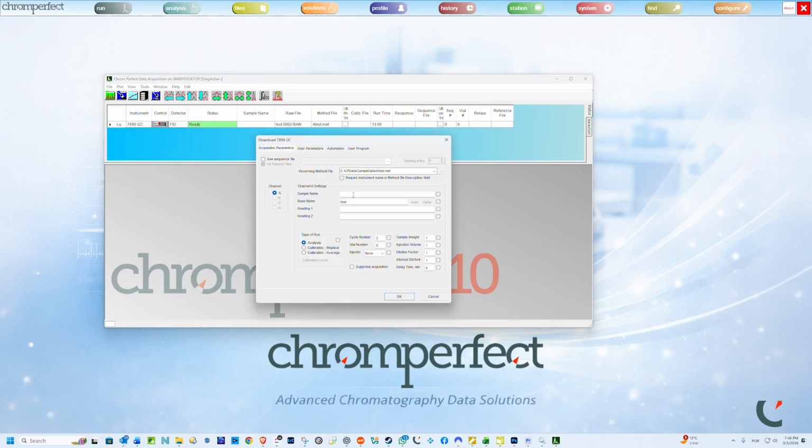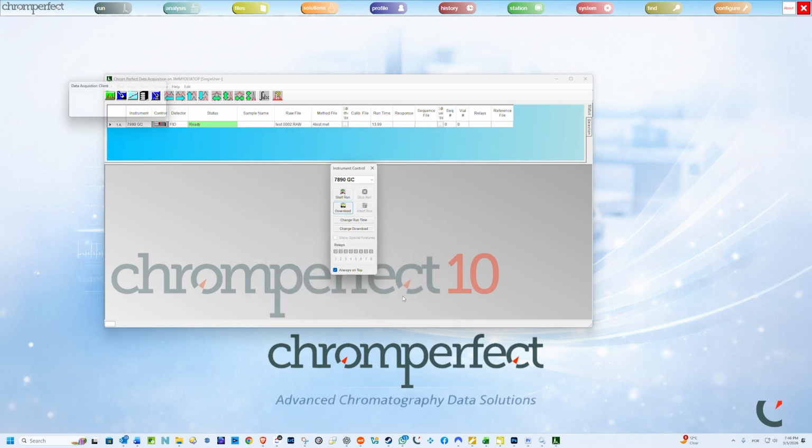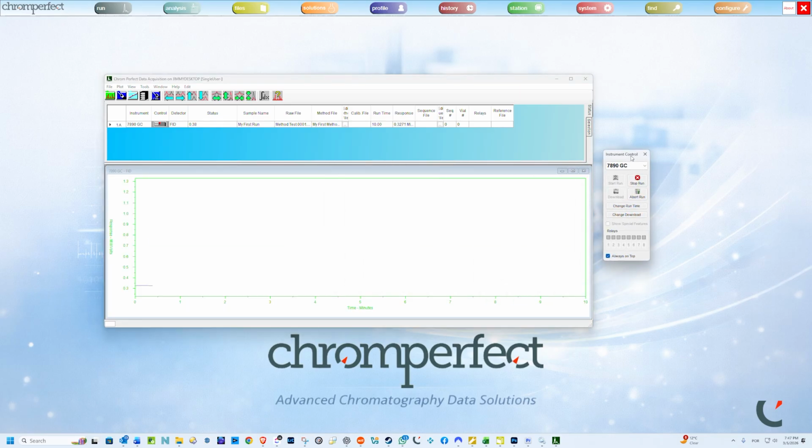Open the acquisition client. First, select the instrument and download the modified method file. If digital instrument control is active, confirm that the instrument acknowledges the download. If analog acquisition is being used, confirm that the correct channel is active. Start the acquisition. This can be done from the software by right-clicking the instrument row in the spreadsheet and clicking Start, or from the instrument control icon, often called the TV remote. Alternatively, Chromperfect will start automatically when the instrument starts either via a manual or auto-sampler injection.